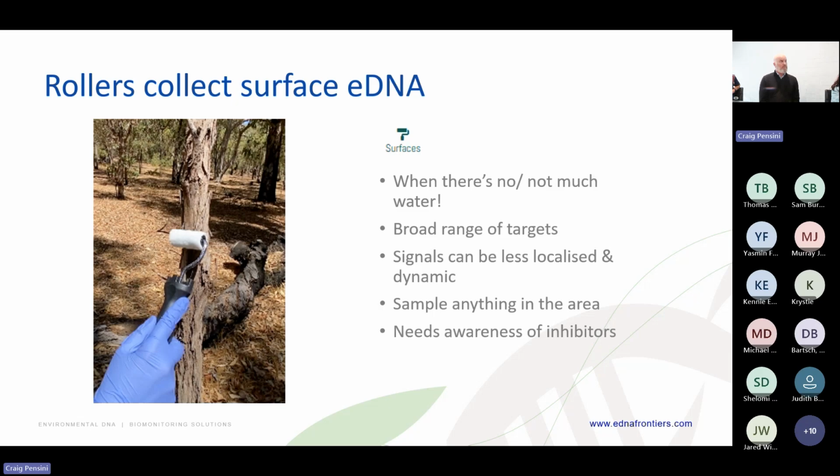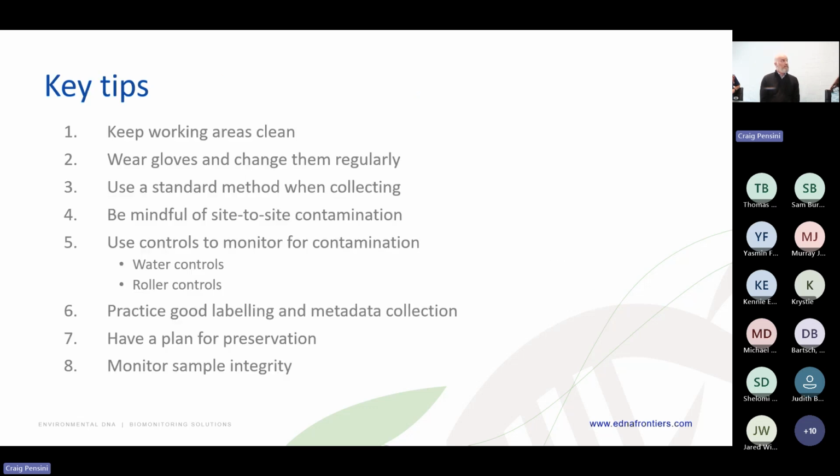I've seen people time themselves for about a couple of minutes and just run around getting as many samples as they can. But you also have to be careful of how many inhibitors you pick up in that process. Rolling over dirt, for instance, and making it black is not necessarily helping, because that is counter-effective for the lab work. Next slide, please.